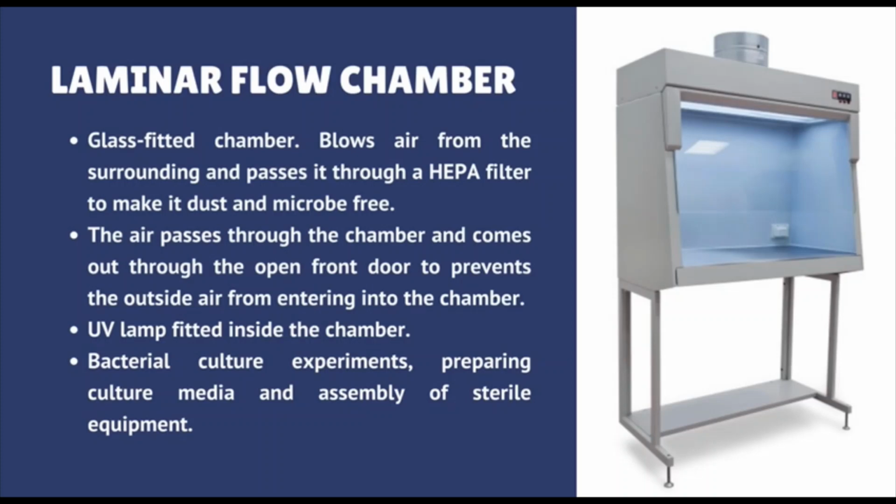Also, laminar flow chamber will play a role in lab ventilation. It's a glass-fitted chamber that blows air from the surroundings and passes it through a high-efficiency particulate air filter to make it dust and microbe free. Then the air passes through the chamber and comes out through the open front door to prevent the outside air from entering the chamber.